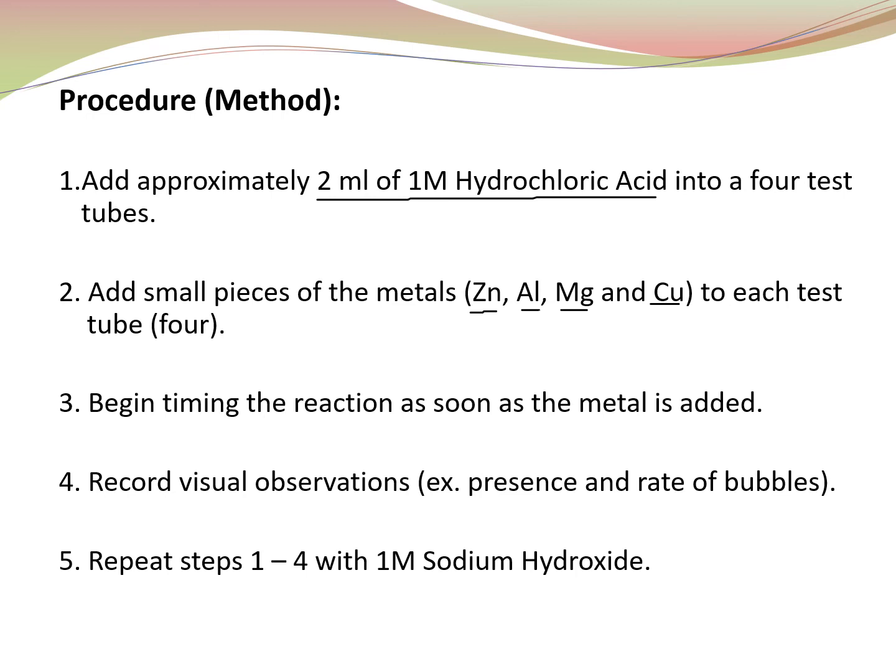So we need a stopwatch to check the timing as soon as the metal is added. We need to know how long it takes for the bubbling to start. So we will record the visual observations like presence and rate of bubbling, whether bubbling is there, how fast it started, and how severe it is.